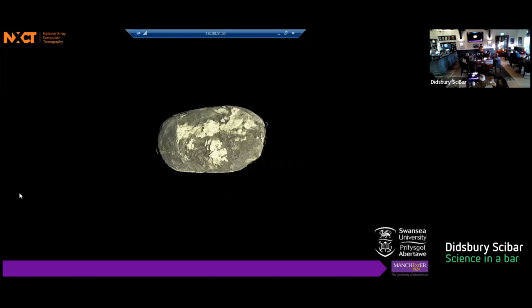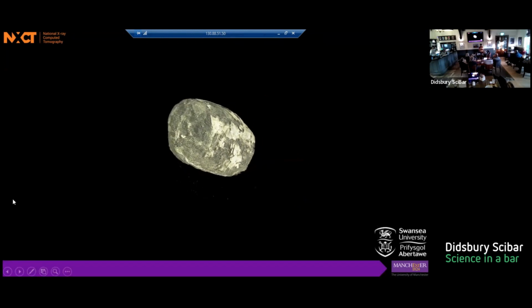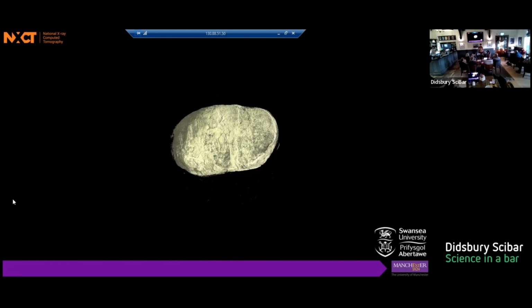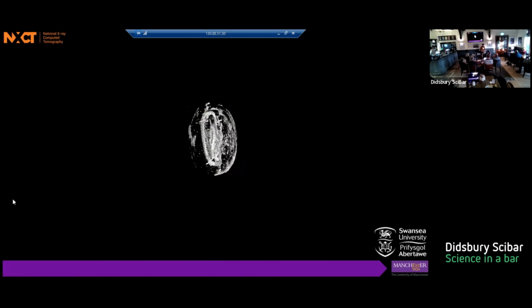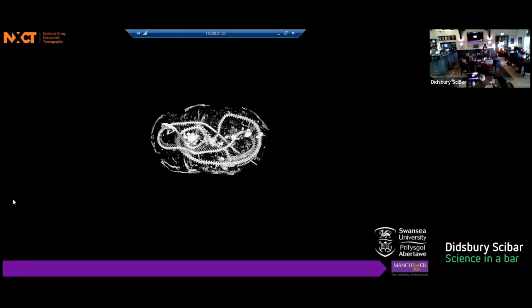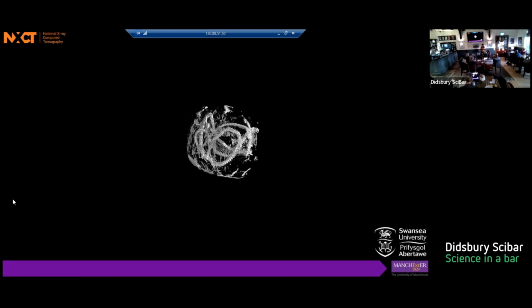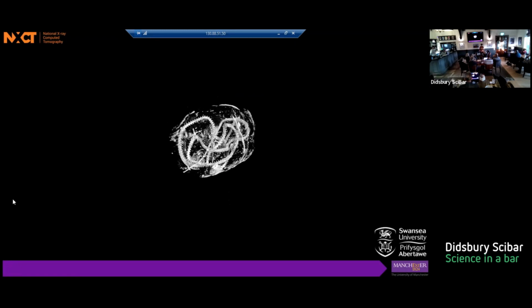But here's one from back at my previous institution, credit to Swansea University. And in this one is a very nondescript package. Often you find mummified packages will sort of have a shape that suggests the interior. So a cat mummy will look like a cat. A bird mummy will sort of have a bird shape to it. But this was just a blob. But inside is this rather gorgeous, very long, very slender snake. And isn't he or she absolutely gorgeous? And also, strangely, looking like it's biting its own tail.